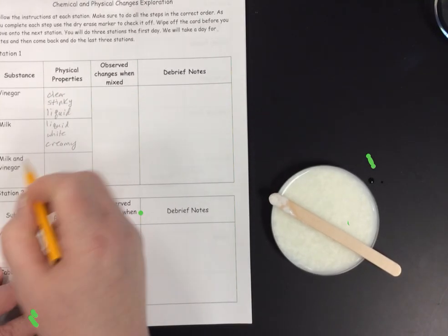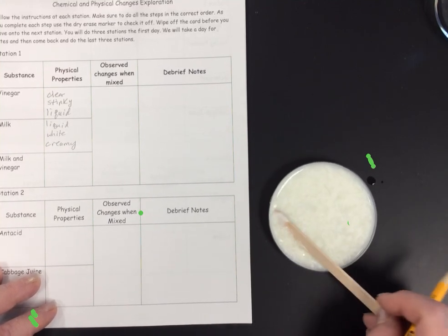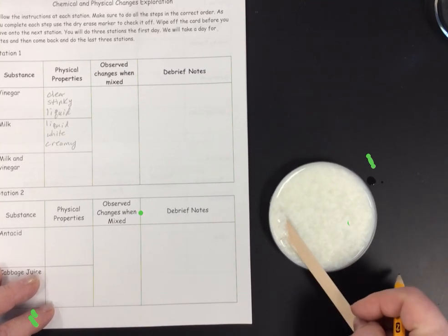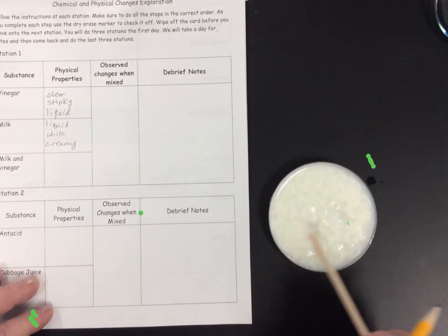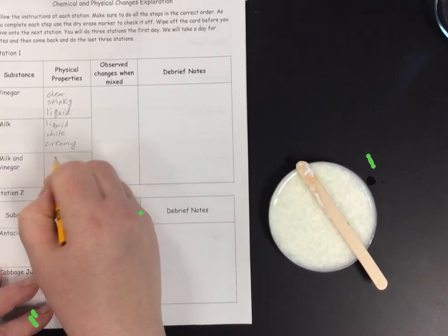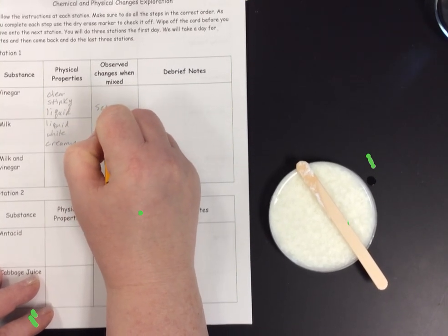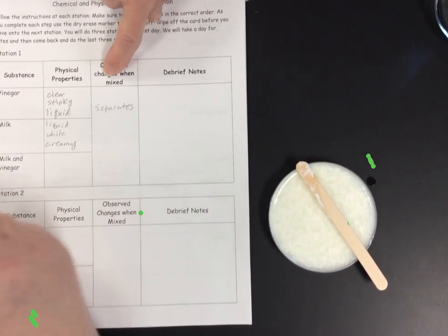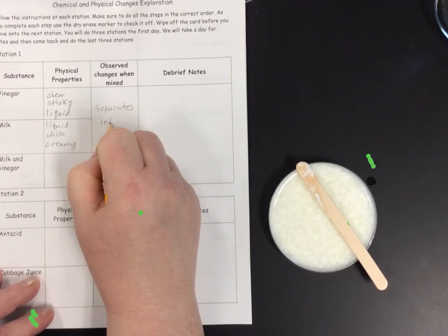The longer it sits, the more it's clumping. Yes, you can start to see that there's definitely... Oh, look at that. It's almost solid down there. You can definitely see that there's a solid versus a liquid. So there was definitely some kind of a chemical reaction because we see some things happening. So what happened when we mixed it? Those are the observed changes when mixed. Well, it separates into some solid and some liquid.